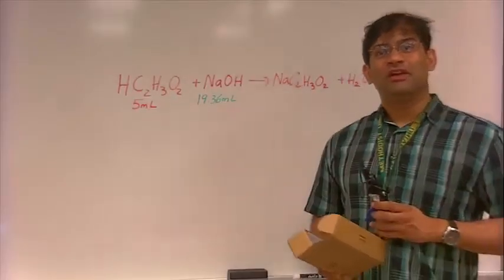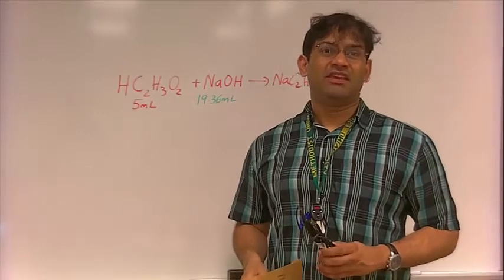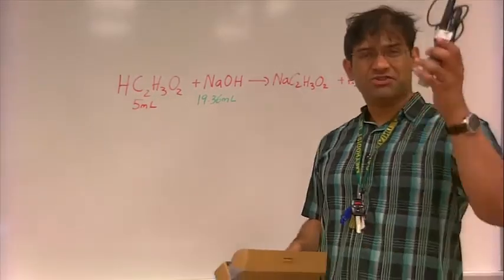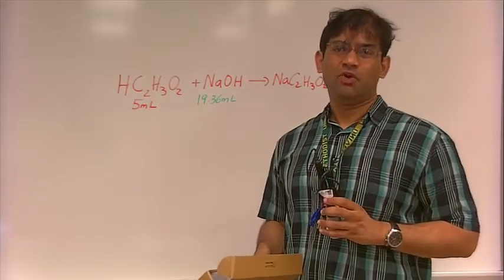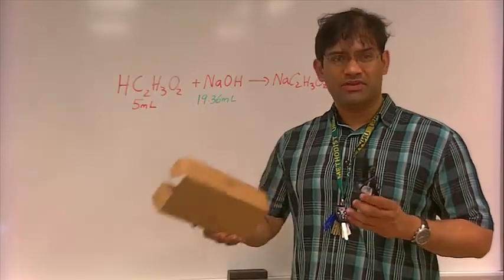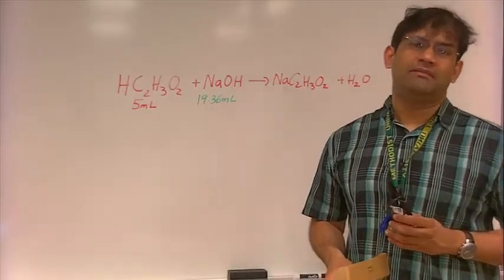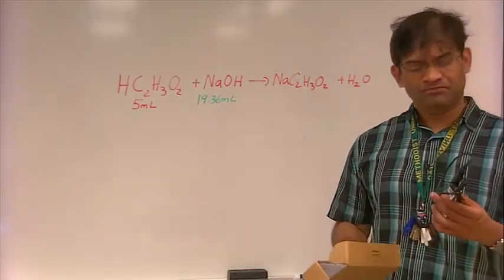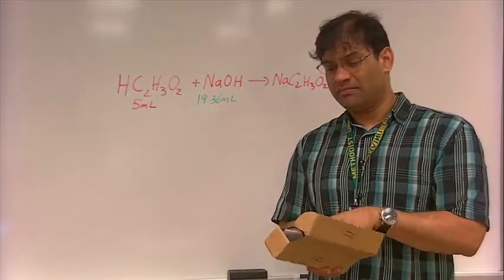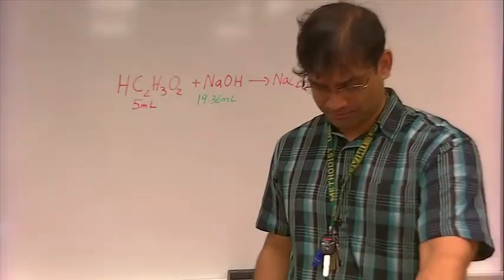Make sure that once you're done, you disassemble everything. You can pour it down the sink, wash the sink with some water. Make sure you clean your pH probe. Clean it and do a little swipe with that Kim wipe, that little white tissue, and then put it back into its storage electrode, okay? Because we don't want the pH electrode to get dry.